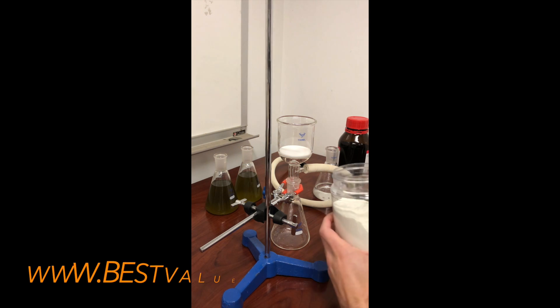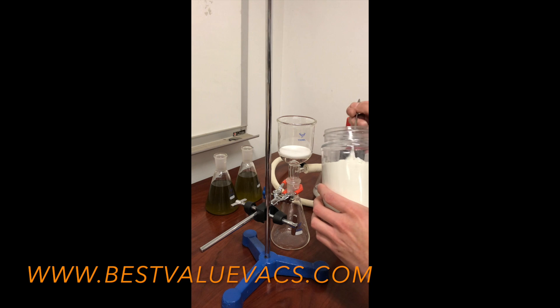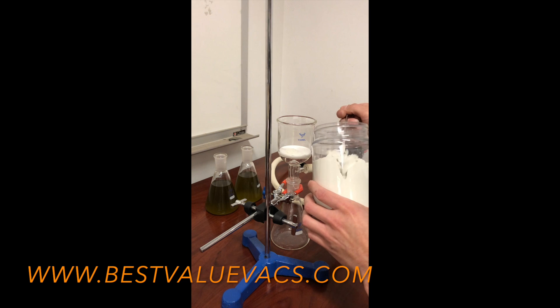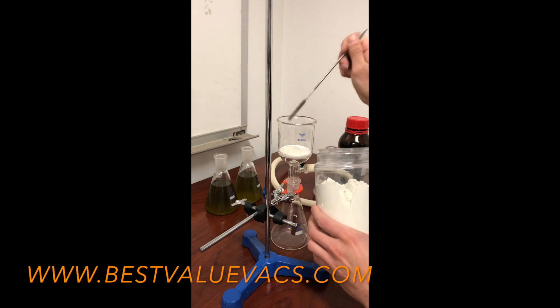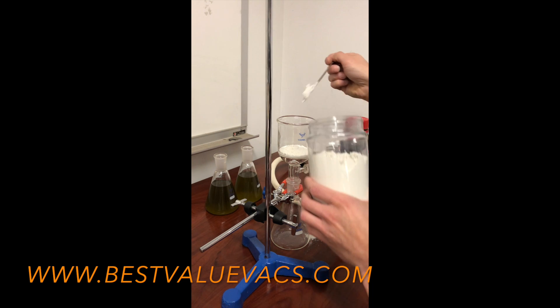This is a demonstration video showing how to use Cellite 545 and other filter medias like charcoal filter media. What we have here is a Buchner funnel with a fritted disc in it. Cellite 545 is a manufactured product — it's like filtering through talcum powder. You can use this to clean up a solution very nicely, really taking the clarity up quite a bit.